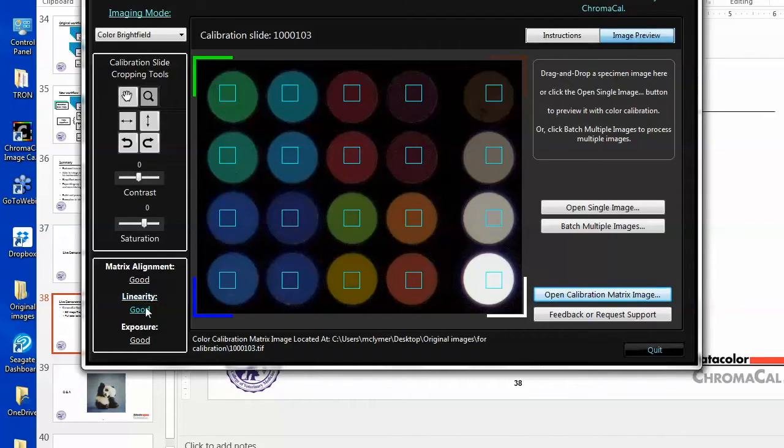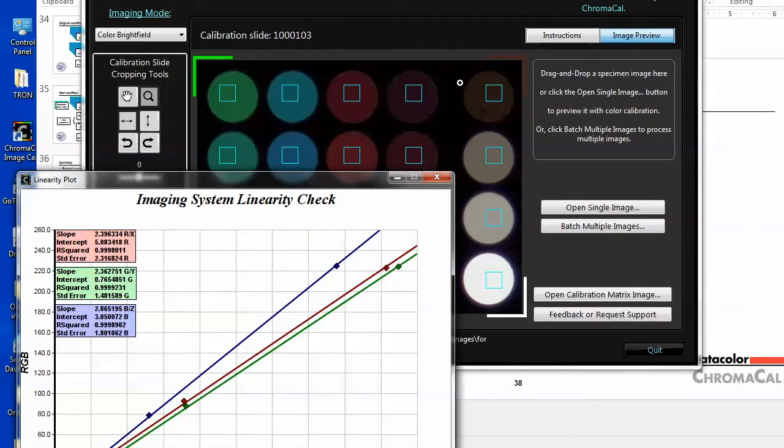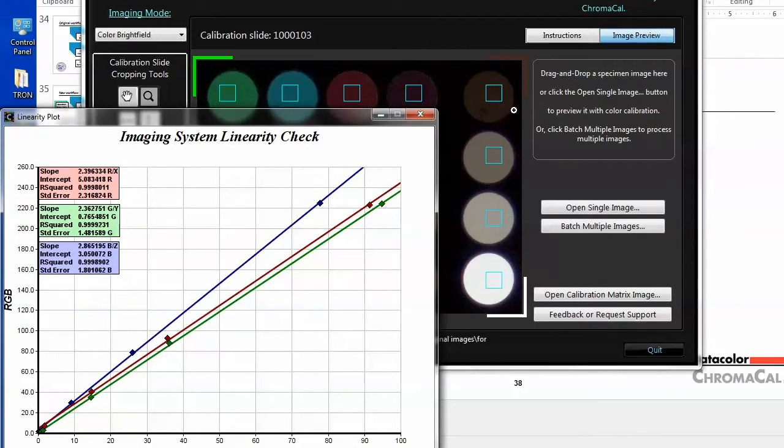All right. My linearity is also good. I'll click on linearity. So unlike Sally's linearity, which had a nice curve to it, this is nice and straight. And we're looking at the regression of the red, green, and blue color components of this rightmost column. So it's not a perfect gray neutral density ladder. It's pretty close, but it's difficult to do that with interference filters, so we had to give it a little bit of color. But we're looking for a regression as close to 1 as we can get, and 0.997 is our cutoff.